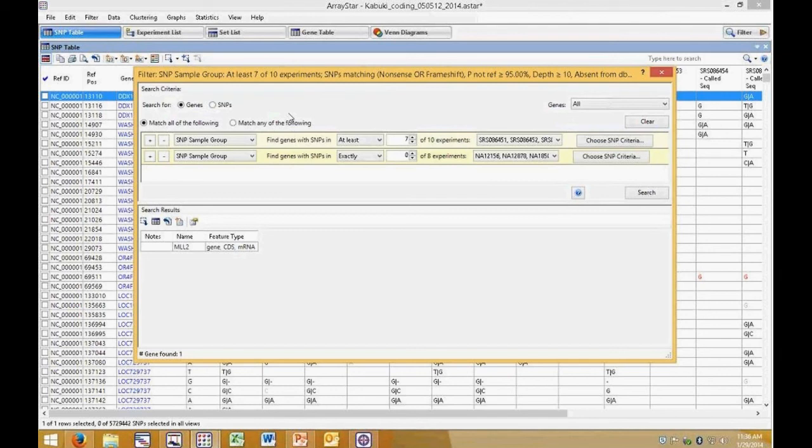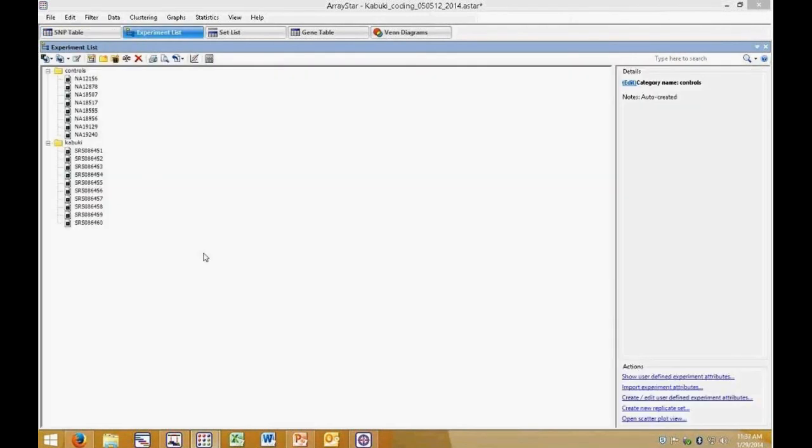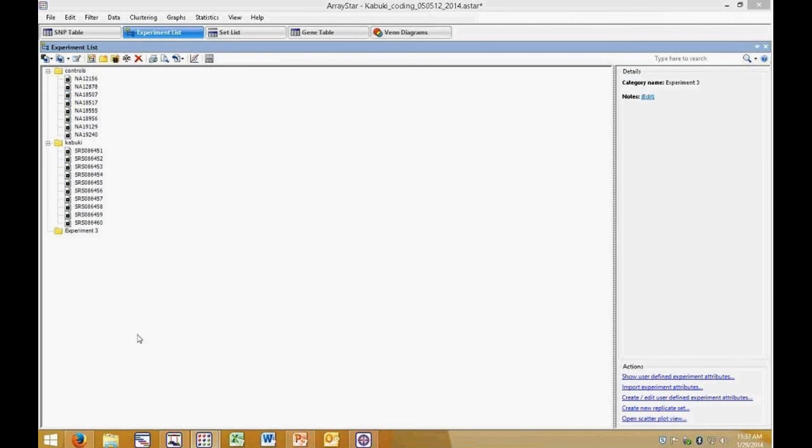Great, thank you. And just one last question. Is it possible to set up more than just 2 experiments, like the control versus disease in ArrayStar? Sure, yeah. Our experiment list is pretty flexible here. You can create new experiments quite easily if you're comparing many different groups.